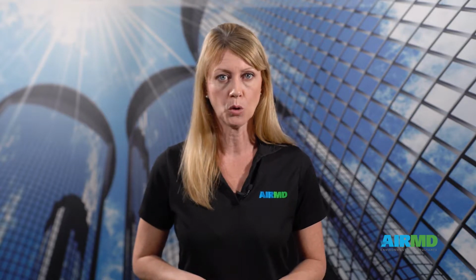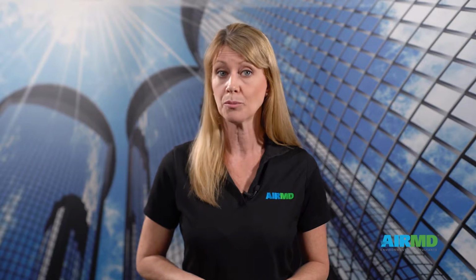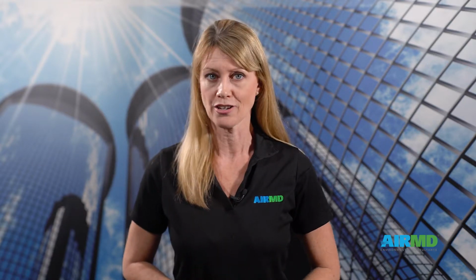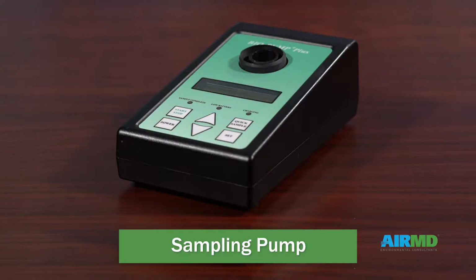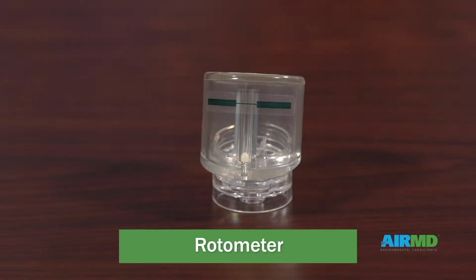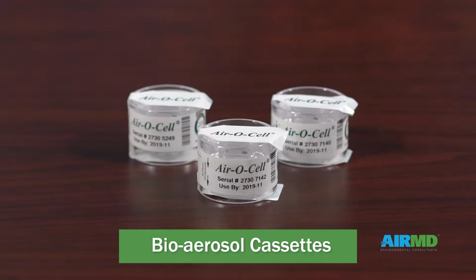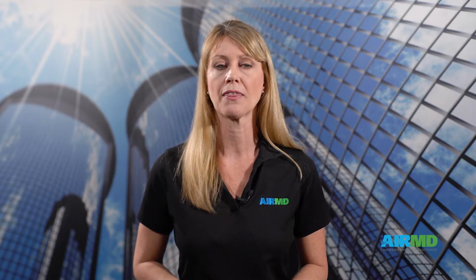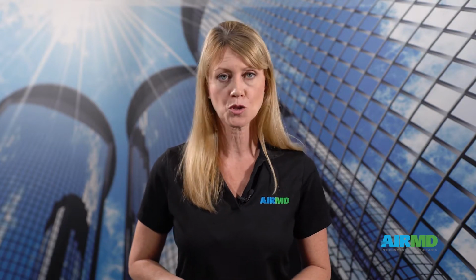Air sampling for mold can provide information about the indoor environment from which the sample was taken. Equipment and materials used to collect the air samples include a sampling pump, rotometer, bioaerosol cassettes, tripod, and chain of custody. To sample for mold in the air requires attaching the battery-operated pump to the tripod.